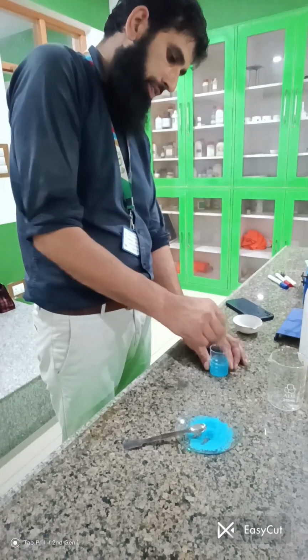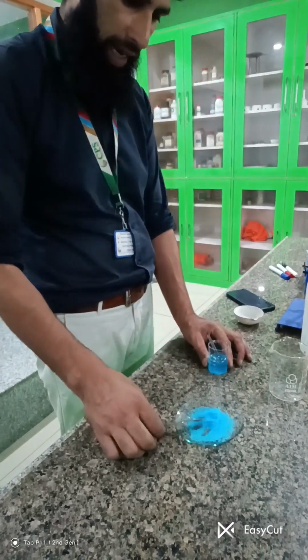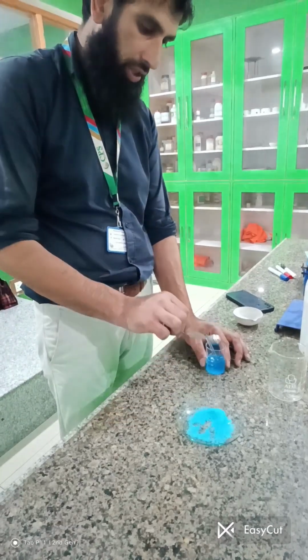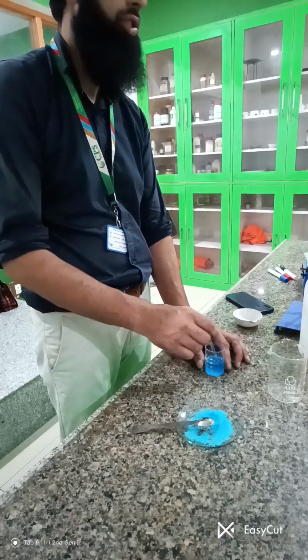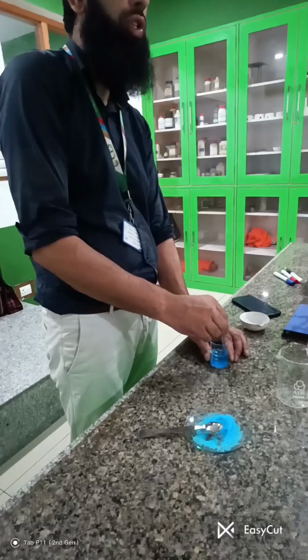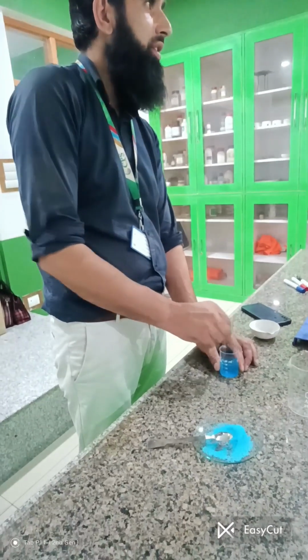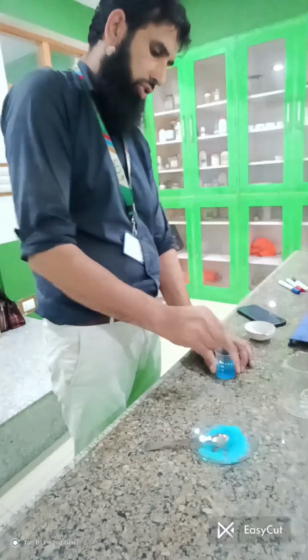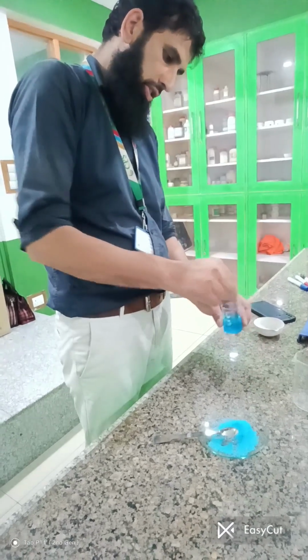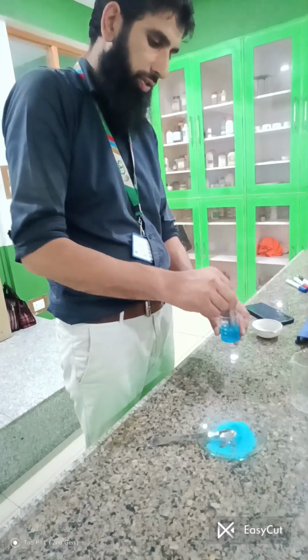After that, we must add more so that we make it somehow concentrated. Do you know what is a concentrated solution? More solute, but less solvent. And what is a dilute solution? Less solute. And we will add more copper sulfate so that it will become somehow concentrated.